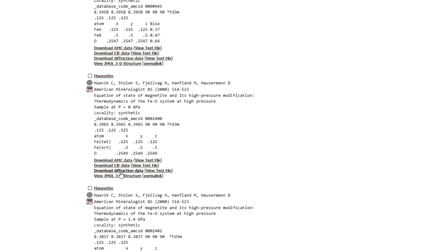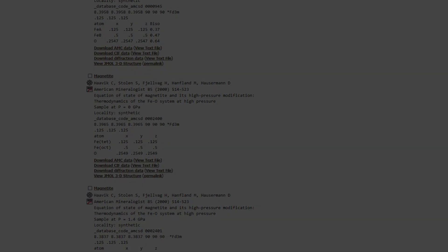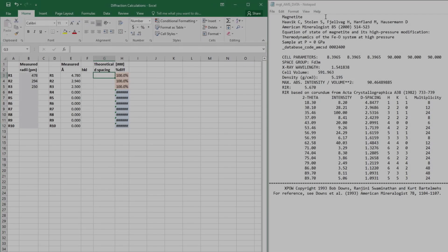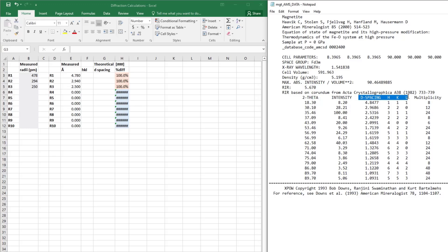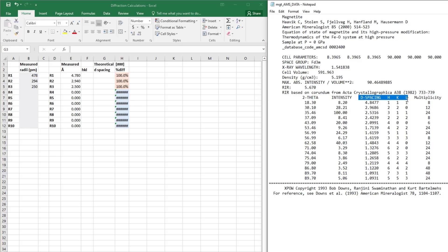Once you're ready, you can download the diffraction data as a text file, and this will be what that looks like. There's a lot of data on here that you don't need at the moment. Really all that matters is the D-spacing and the HKL of the plane.